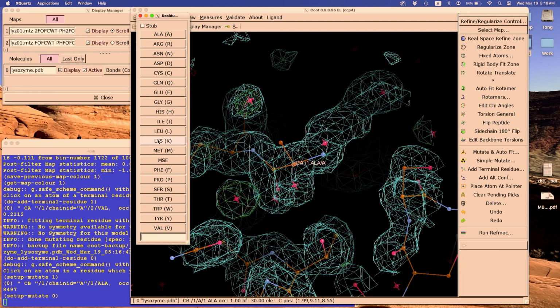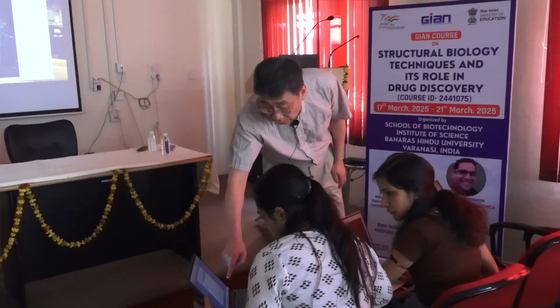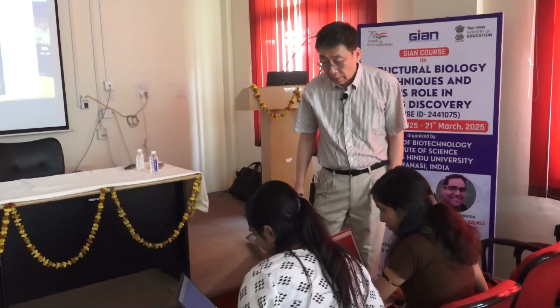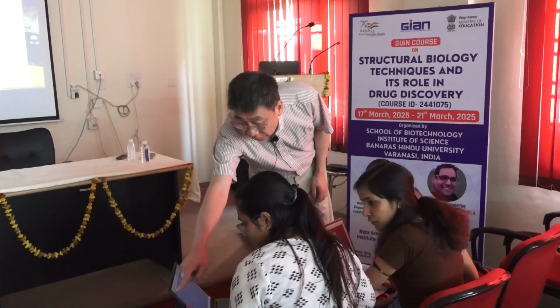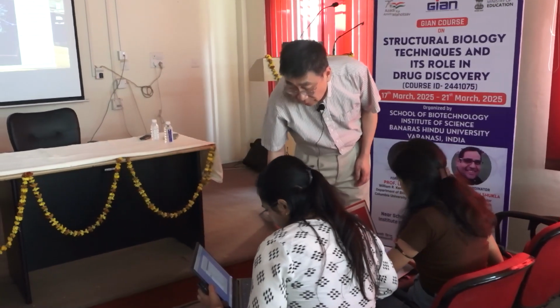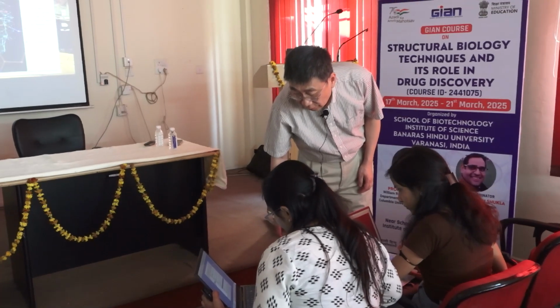So that's a file. Open, auto open MTZ. Did you do auto? Yeah, like that one. Yeah. Say OK. No, file. No, this one. File. No, yeah, under file. Auto open MTZ. Yeah, right. There you go. MTZ. Yeah. And say OK.